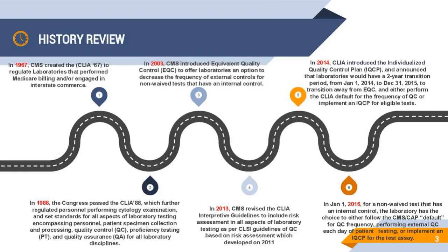In 2003, CMS introduced equivalent quality control. Here is where it started. Why did CMS introduce this program? To offer laboratories an option to decrease the frequency of external controls for non-waived tests that have an internal control.